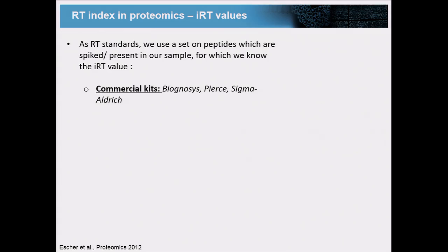So where do we get RT standards? There are different ways to approach this topic. One of them is commercial kits, such as the one mentioned here from Biognosys, from Pierce, from Sigma.